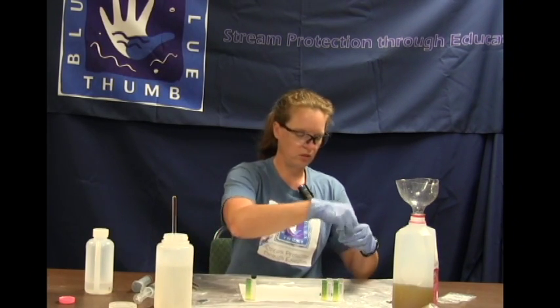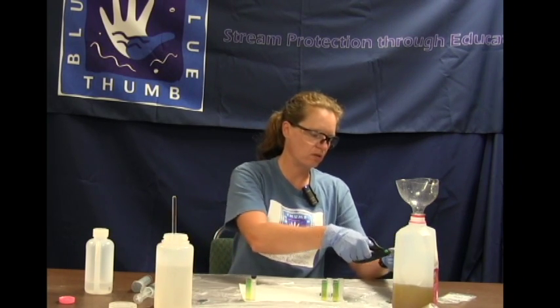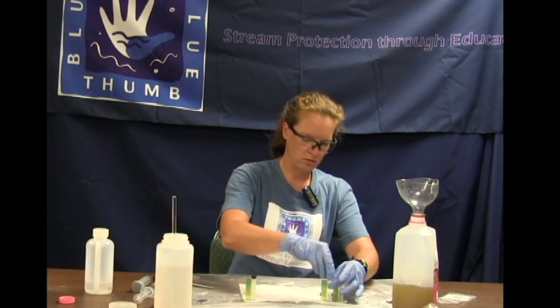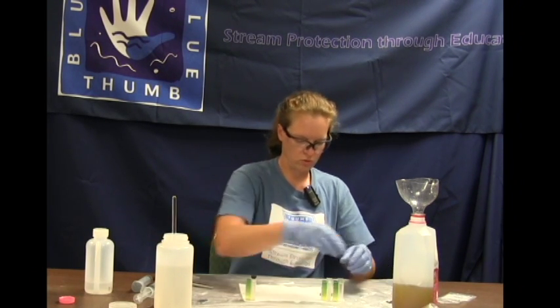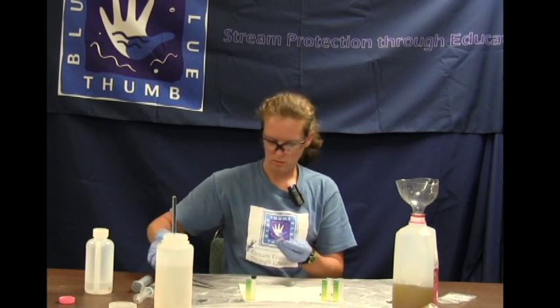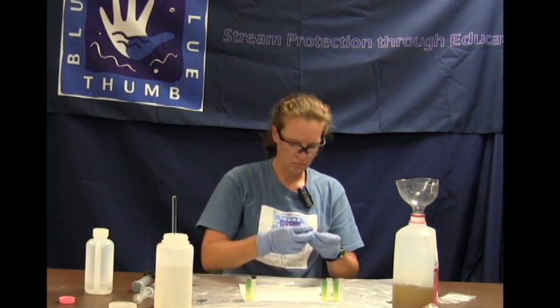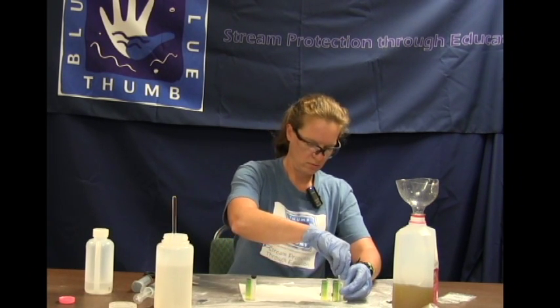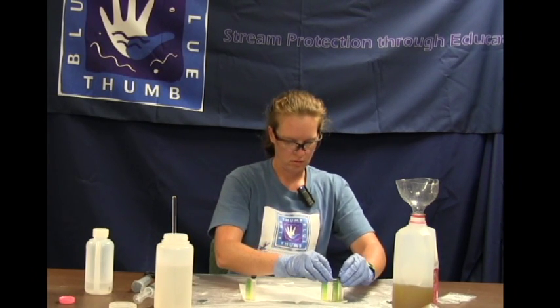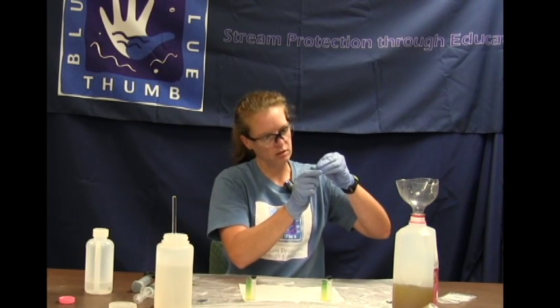So we'll go ahead and put in 1 packet and shake it up and agitate till it's dissolved. I usually just get them all 3 poured in and then shake them at once. So my ammonia salicylates are all in. Make certain and get the lids on nice and snug.